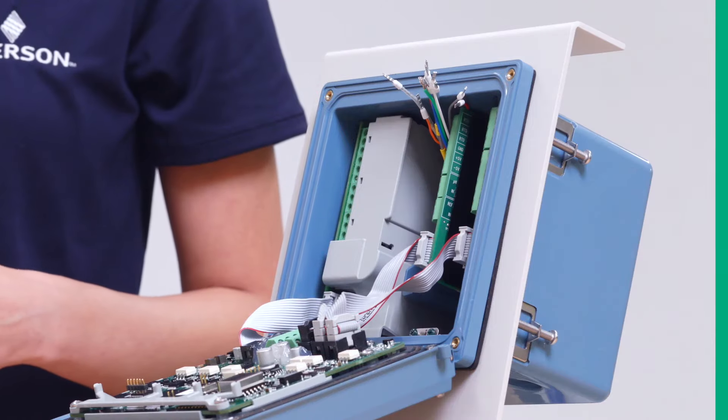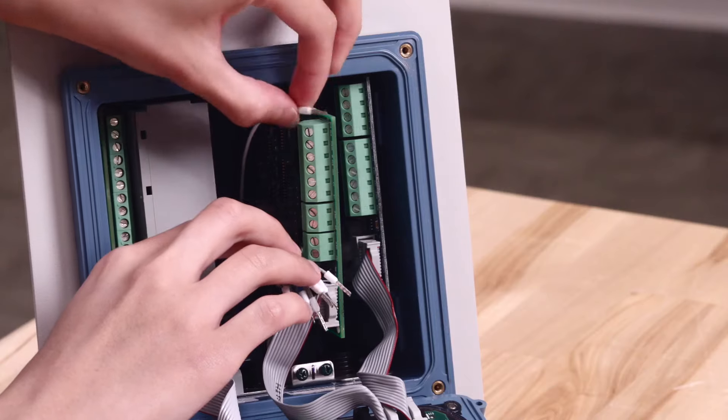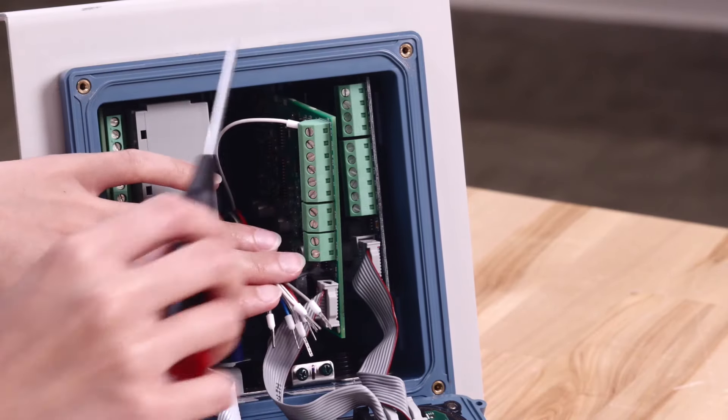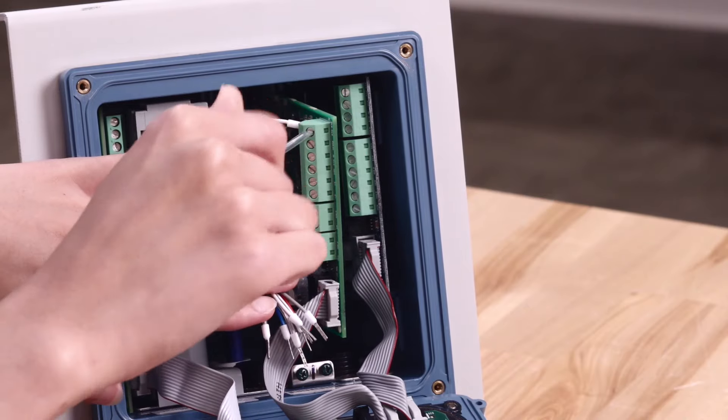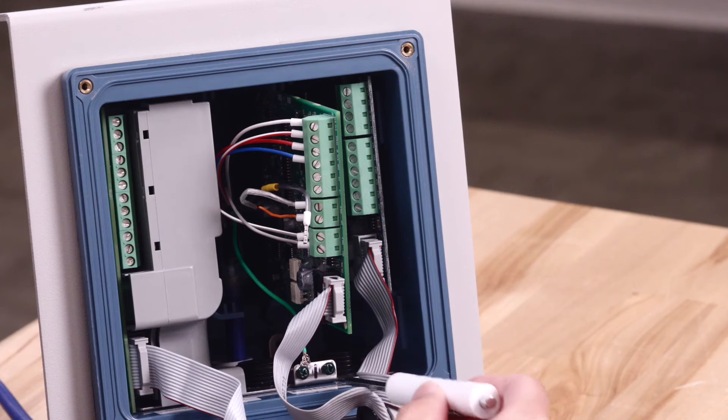Now, partially pull out the PH/ORP sensor card and follow the wiring diagram to connect each wire to its respective location. Use a screwdriver to loosen each of the terminal screws before inserting each wire, then tighten the screws after each wire is in place.